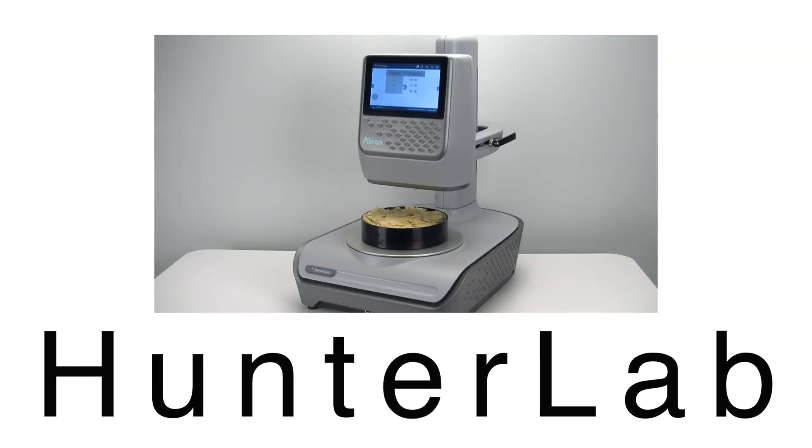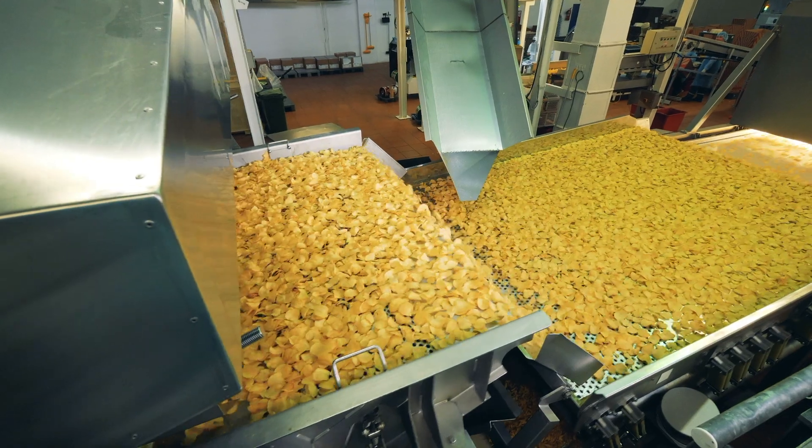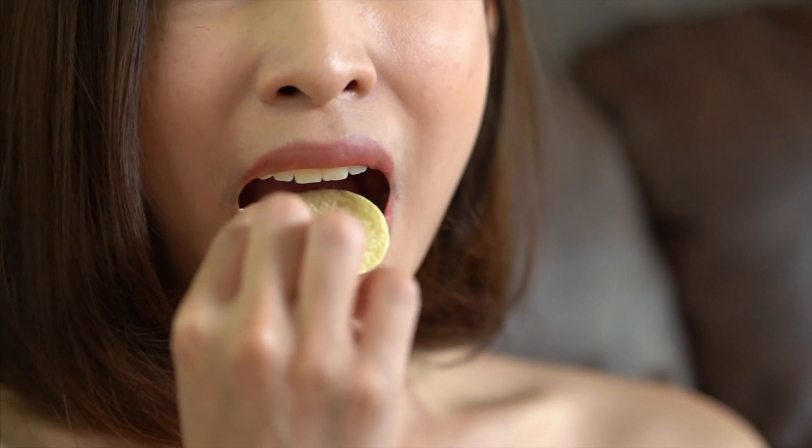It's that easy. HunterLab is the food industry's premier color measurement choice and the HunterLab Eros is the best answer for measuring the color of chips. So, you make your chips. We'll help you make them look good. Good enough to eat.